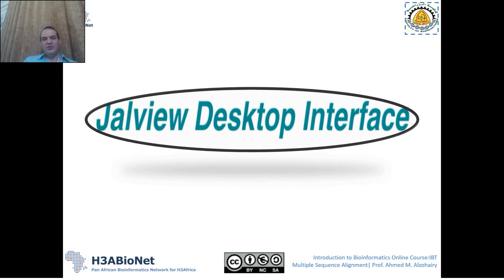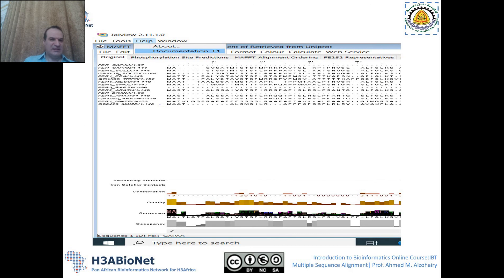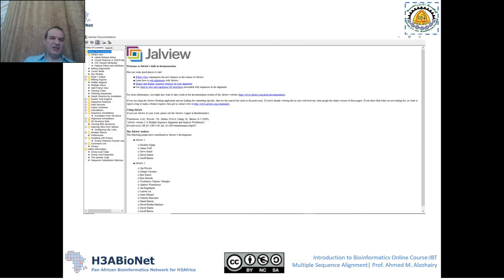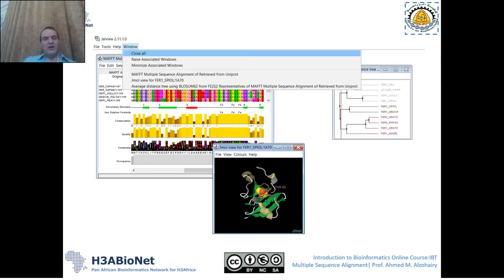The Jalview desktop interface is very straightforward. If you would like to read more about Jalview, you can press the Help menu, go to Documentation, and find the Jalview book — a full documentation that explains every part of Jalview and how to use it.